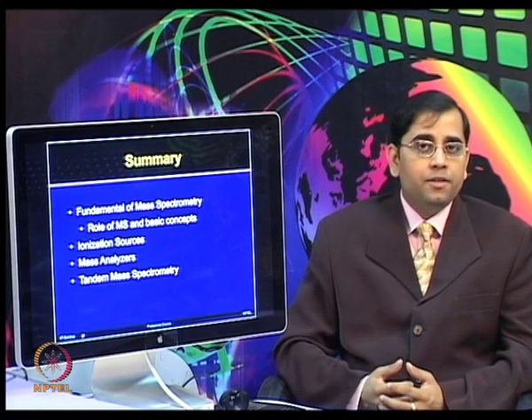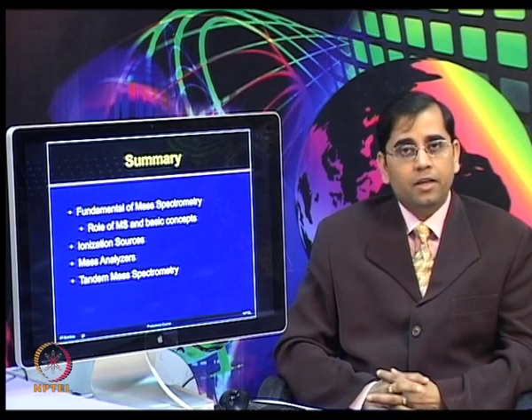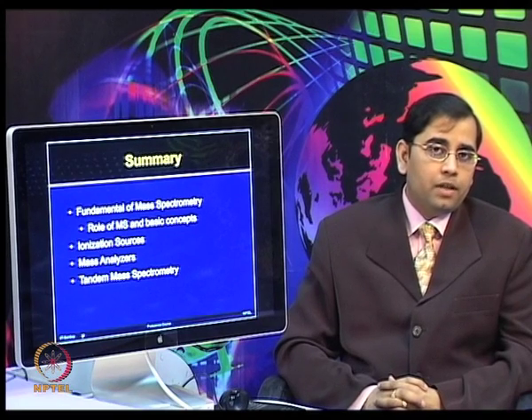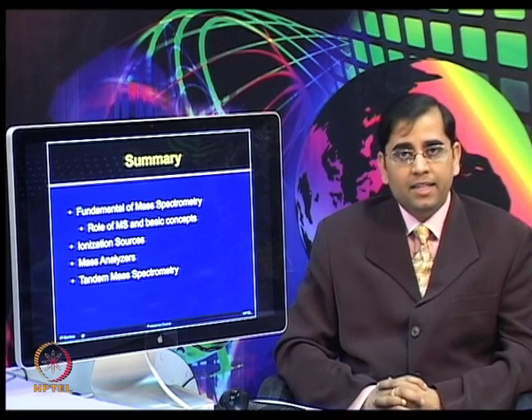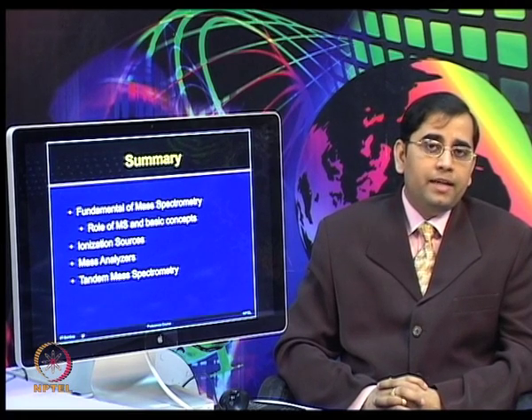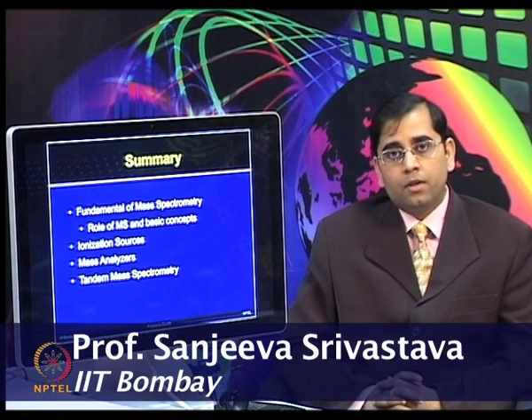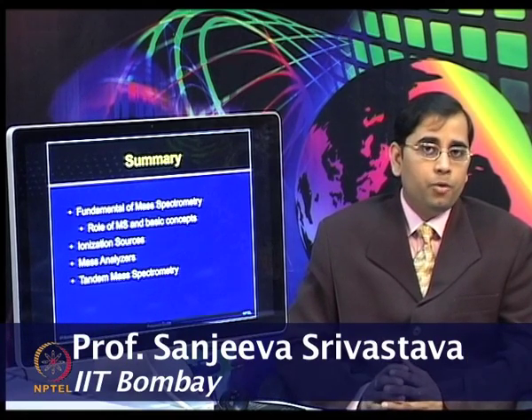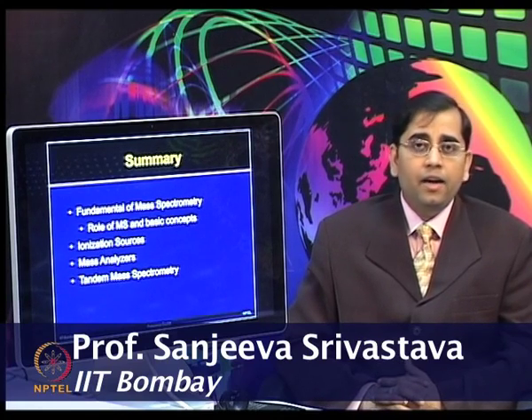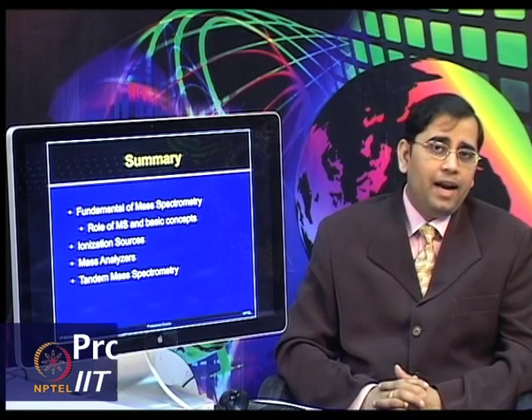From today's lecture, I hope you are able to understand some of the fundamental concepts involved in mass spectrometry. Very briefly, we touched upon ionization sources and mass analyzers, and then we talked about Tandem MS configurations. In the subsequent lectures, we will talk in more detail about some of these ionization sources, mass analyzers and different types of mass spectrometry configurations and their applications.